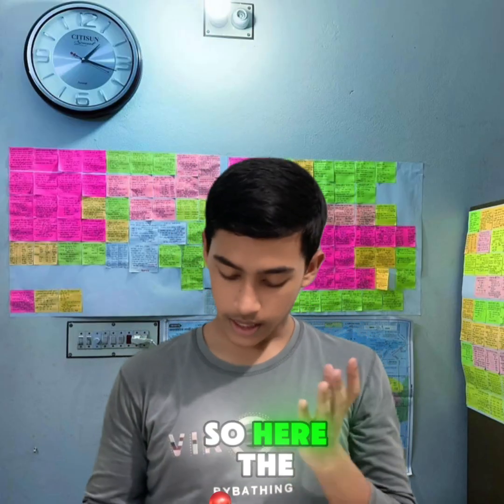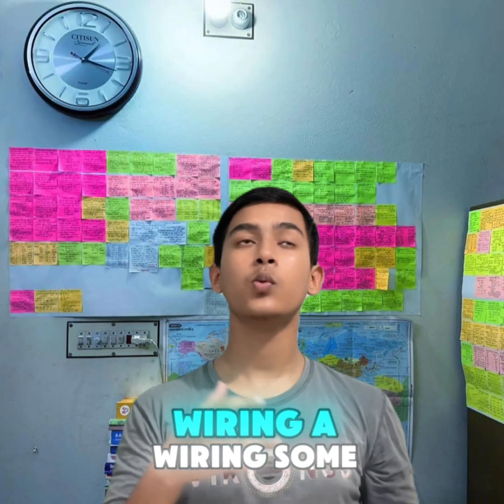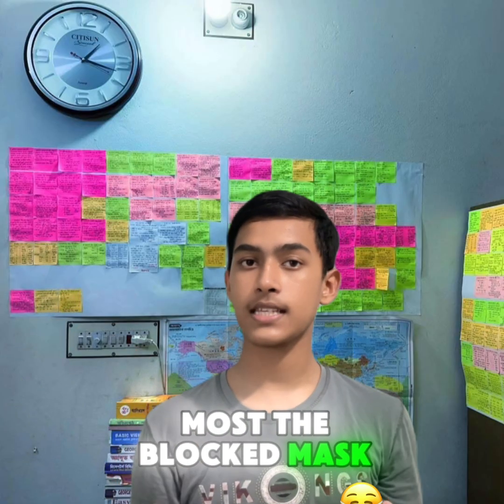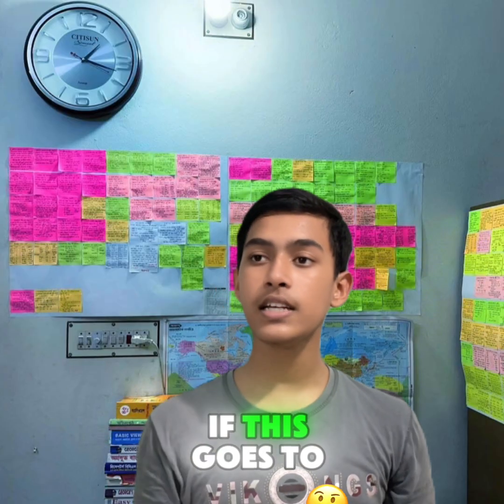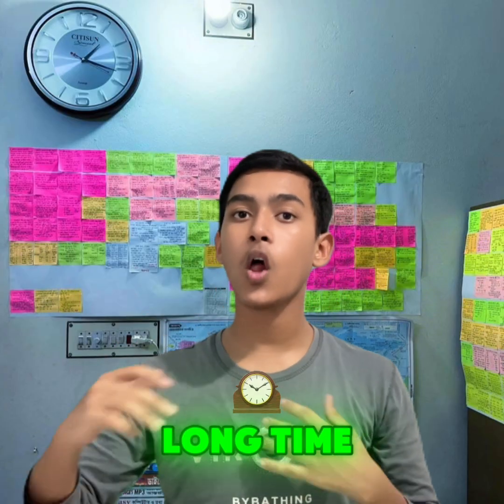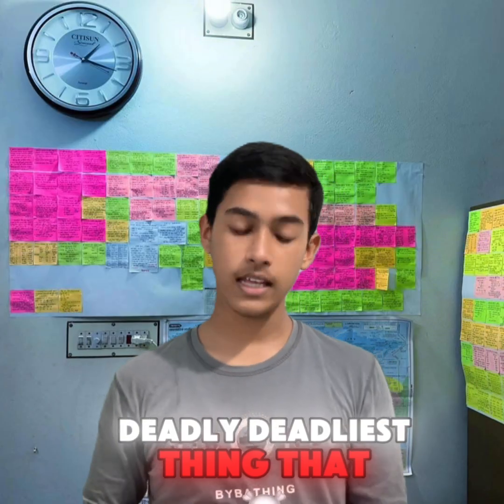So here we have to ensure we are wearing a well-developed mask, because if it enters our body while breathing, it may harm our body for a long term. It may be short term, but if it harms for a long term, it may cause something deadly.